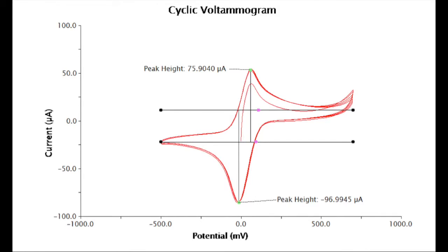This is the CV of the 10 millimolar ferricyanide solution using a 2 mm diameter electrode with a layer of 2% linear PEI after it was evaporated with nitrogen. Evidently, the shape of the graph near the upper potential changed, as well as the electrode current range, which seemed to increase with the layer of PEI.